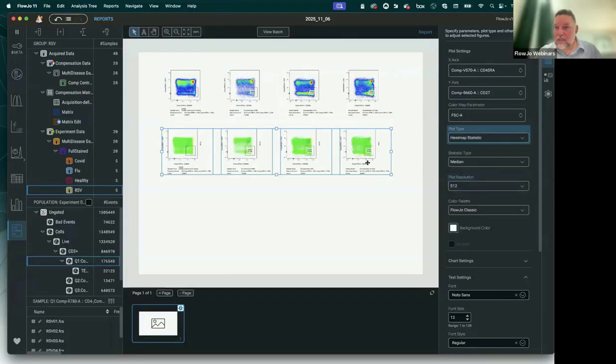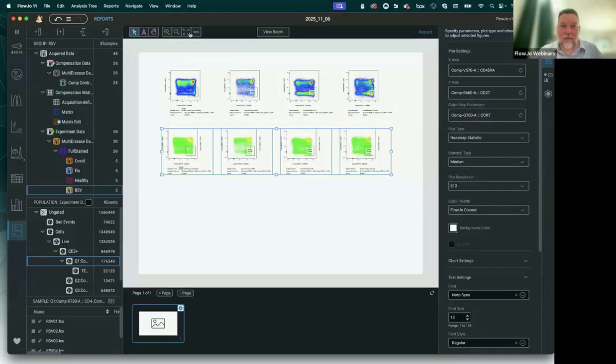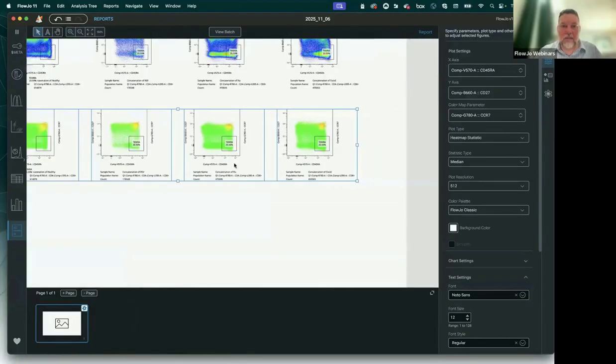And the statistic that I'm going to focus on there is going to be CCR7 maybe. Right, so there's our CCR7 positive that end up in that top right-hand corner because they are CD27 positive as well. Just an example, right, of manipulating the plots, right?